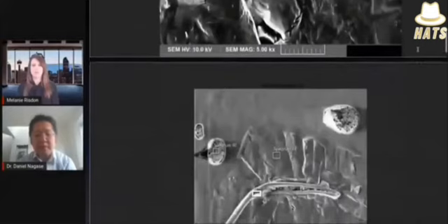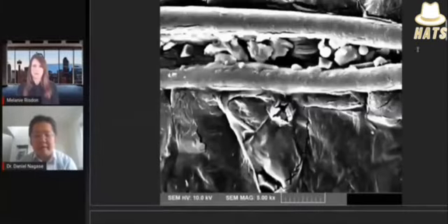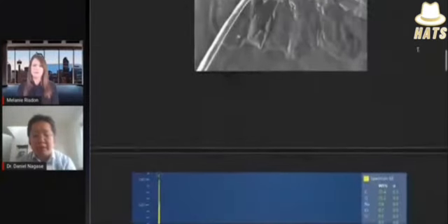So what you see in that folded over bit of strand, actually just one screen up for a second, is you see these little things that look like balls or eggs, right? And you know, that strand could be carbon fiber or it could be a hair fiber. We don't know what it is. So let's scroll down and we'll have a look at the X-ray spectroscopy to see what exactly those little ball shapes and strand shapes are made of.